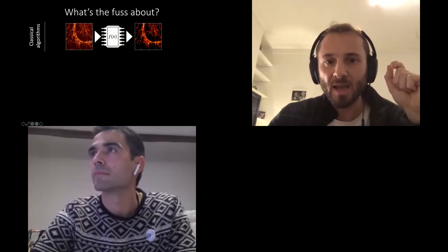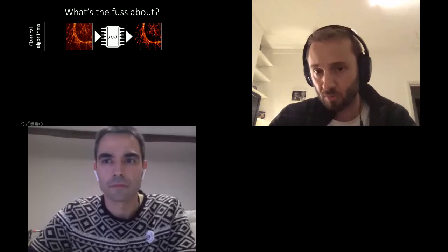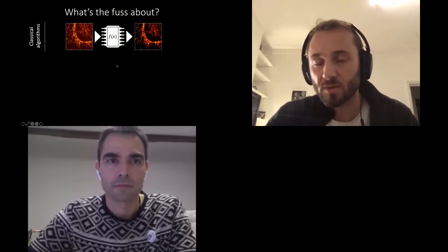So I'll start by just answering this question. What is the fuss about? And first of all, it's useful to know what classical algorithms do. In the case of classical algorithms, you basically have an intention, which is in this case, say, denoising an image. You'll go from left to right. And what you'll spend time on is trying to design mathematical operations that will do what you want, right? So that could be, say, a Gaussian filter on your image that will improve the signal-to-noise ratio slightly.